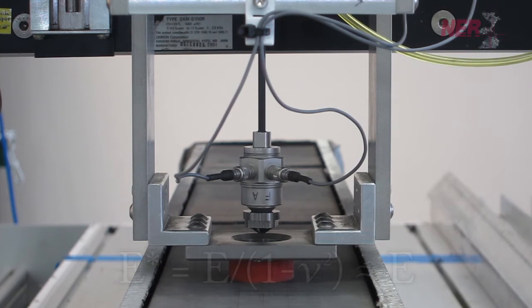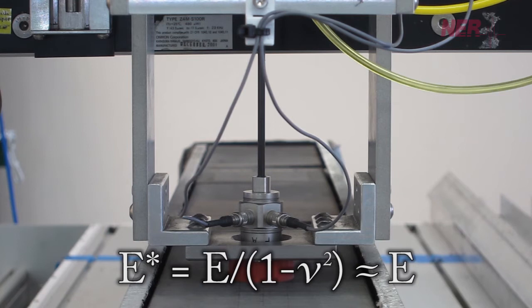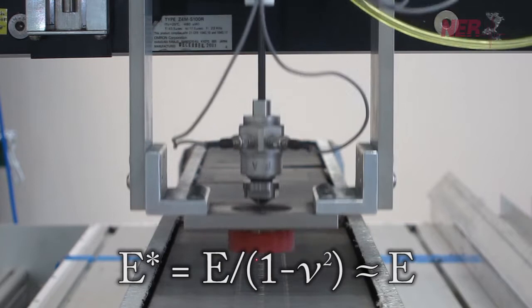Thus, the impulse hammer can be used to rapidly quantify variations in Young's modulus as a function of depth and/or on a large number of core plugs.